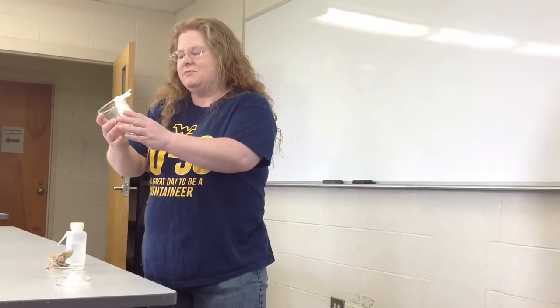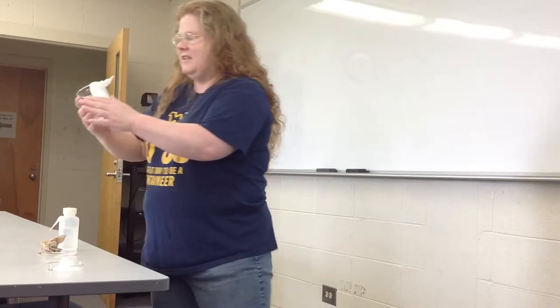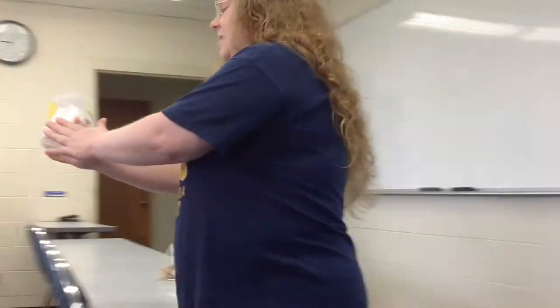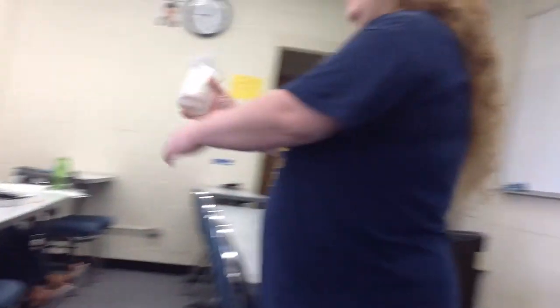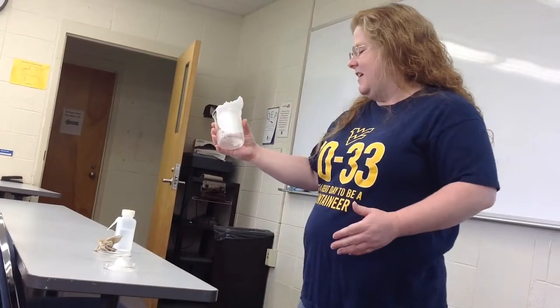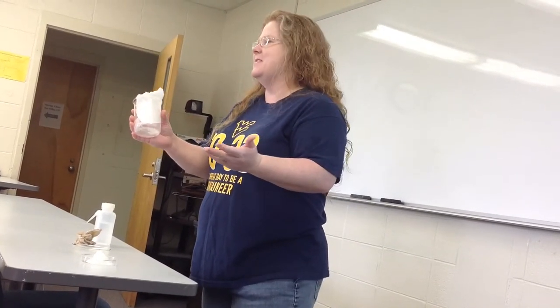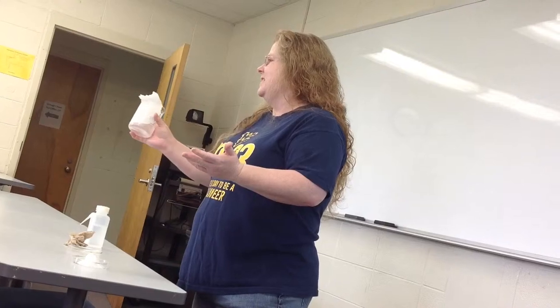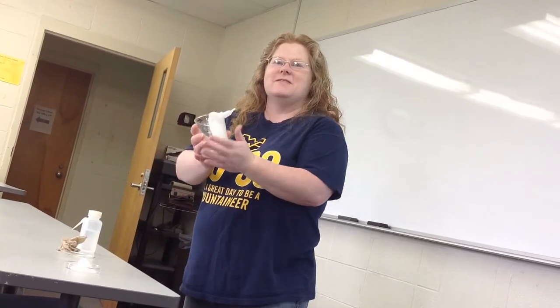This was at room temperature. I should have had somebody touch this initially, but just touch the outside of the beaker — it's warm. This is what they call the hot ice trick, how to make a solid. It's actually warm. It's not really ice, of course, but you can trick people into believing that you just made ice that got hot, because it does get pretty warm.